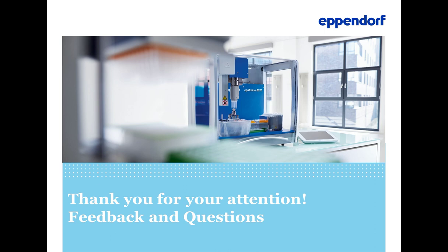Thank you for that clarification, Tim. Now, how do I know which settings to choose for my liquid when I am using a robot?